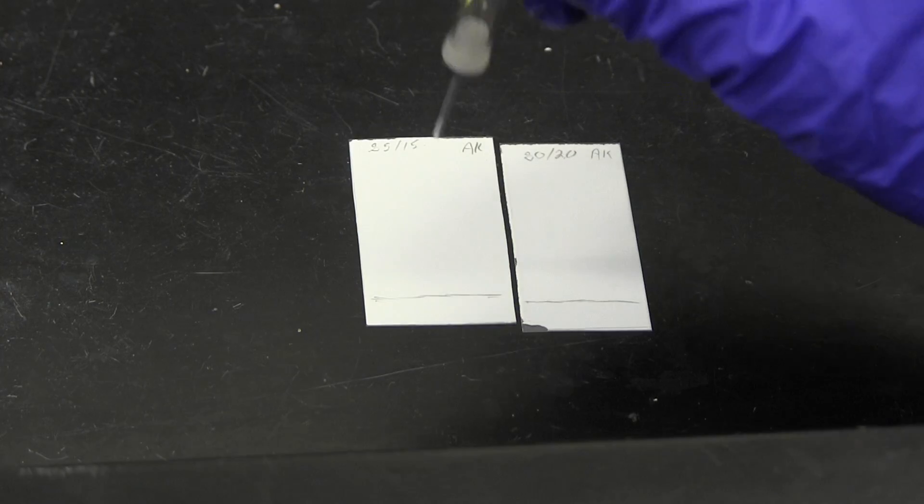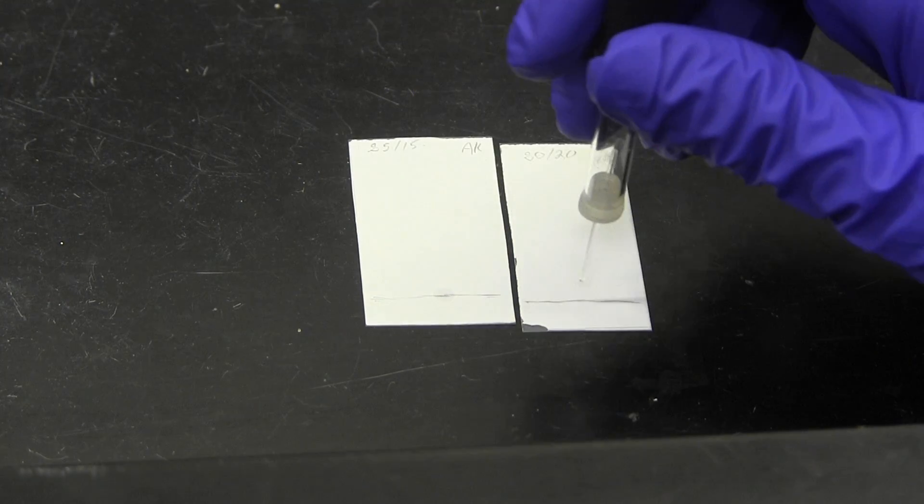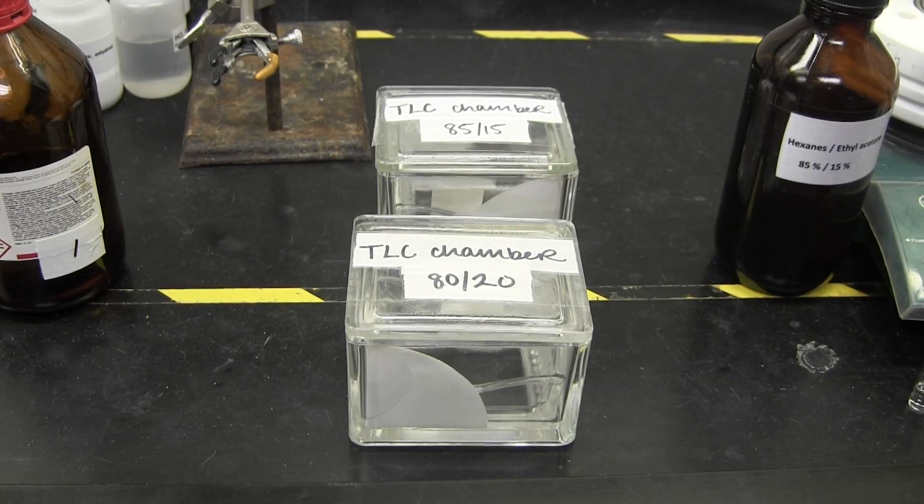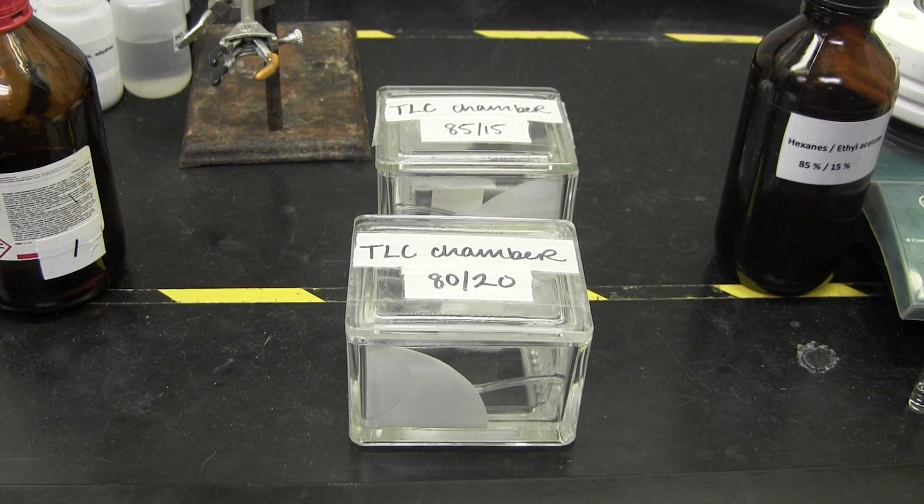Once you start the reaction, you will need to determine a TLC solvent for your unknown. To do this, use the TLC method used in previous labs. You should have saved the drop of your alcohol. Use this to spot on a TLC plate and determine the solvent.